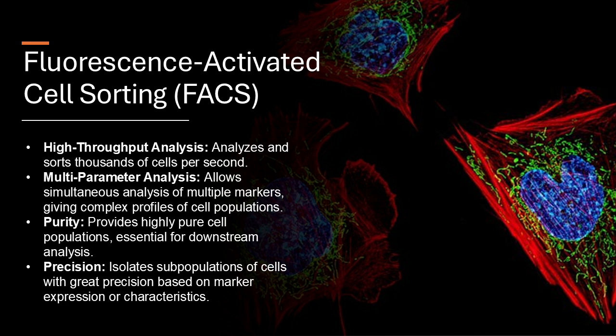Wow, that's so intricate. I'm starting to see the complexity of this technology and how it lets scientists analyze cells in such detail. What about the fluid that carries the cells? It must be important to make sure the cells flow through the system smoothly. You're right. The fluidic system is critical. It uses precise pressure control to ensure that the cells travel in a single file line through the laser beam. This is essential for accurate analysis because the detectors need to measure the light from each cell individually.